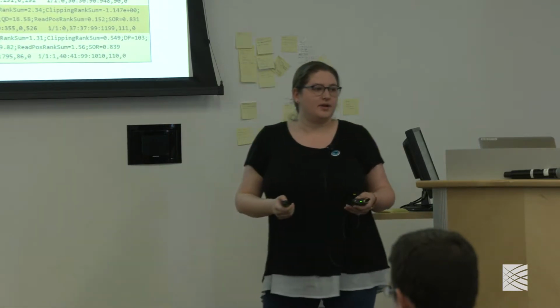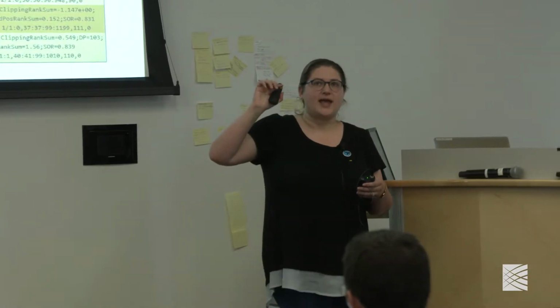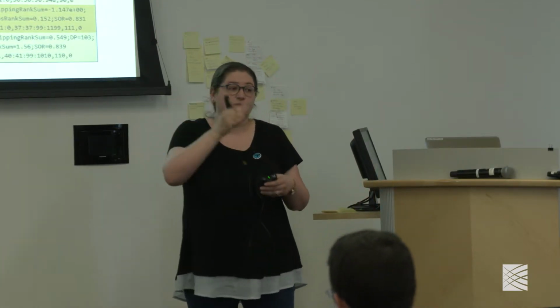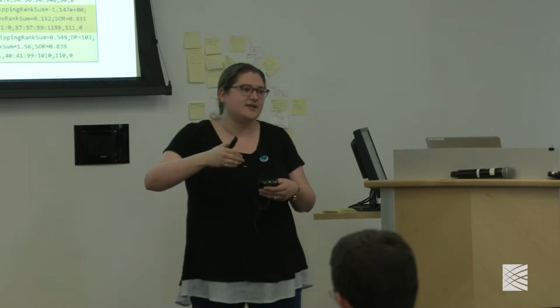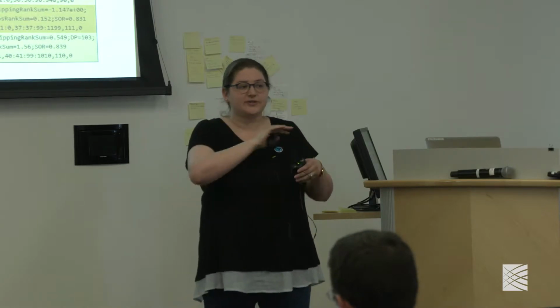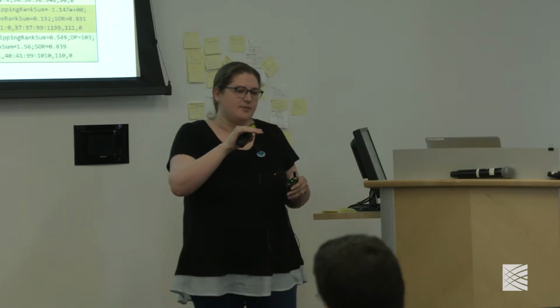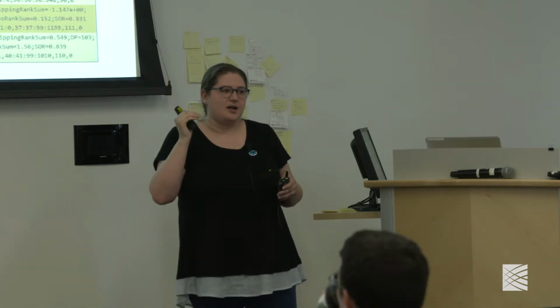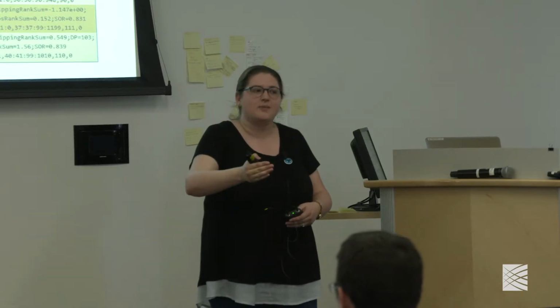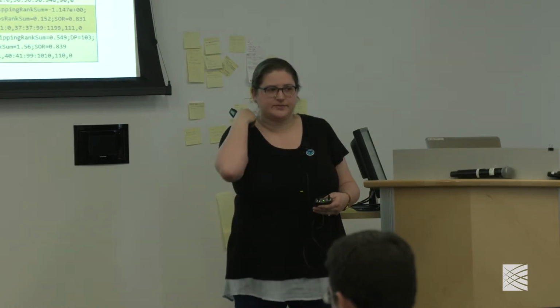Why do you need to do joint calling if you have a reference genome? Isn't that the point of the reference? So the question is why do we need to do joint calling if we're still comparing to a reference. The joint calling is going to use the actual read data from many samples together to give you more statistical power in calling the variants. The reference is just a static string. It never changes. For a given reference build, it just says that at this site there's an A. And then for each of your individual samples, you actually have read data that's going to tell you, oh, actually, it's pretty common that there's a G here in the population, so that's going to inform the variant calls we make at that site.